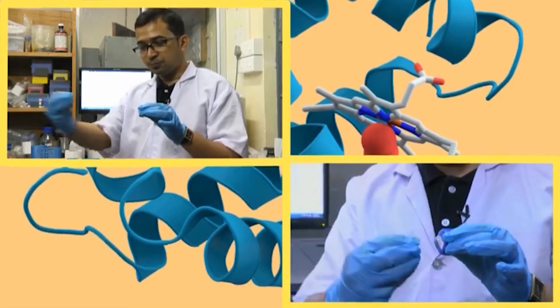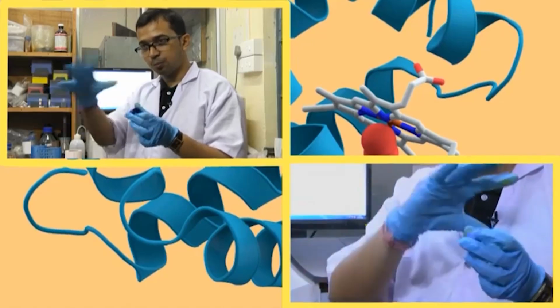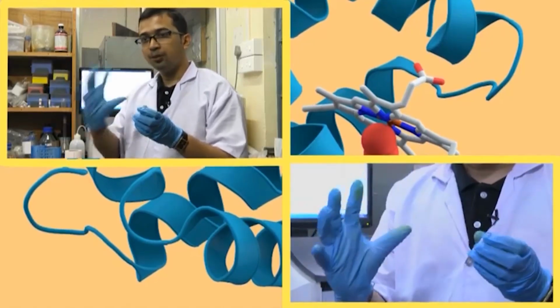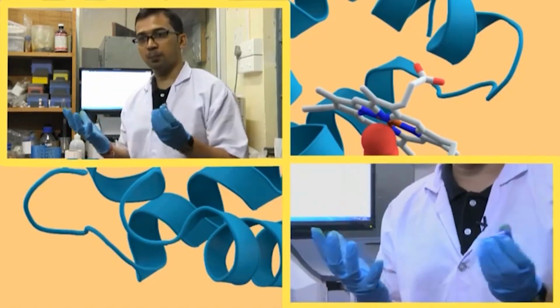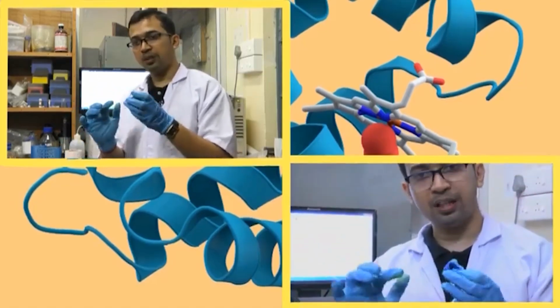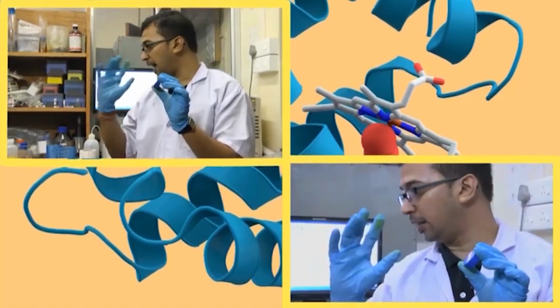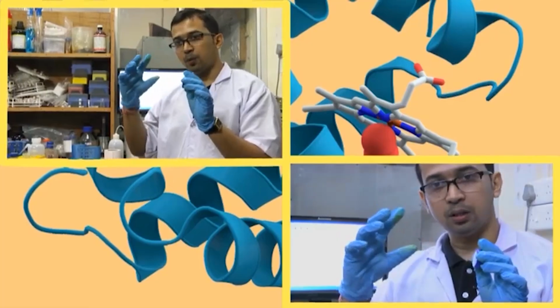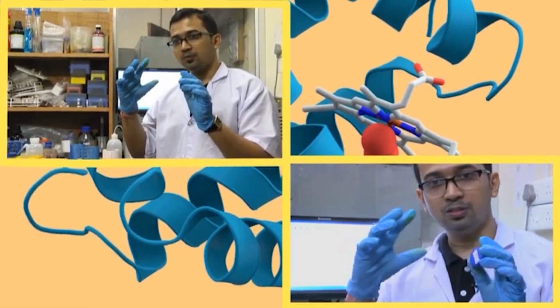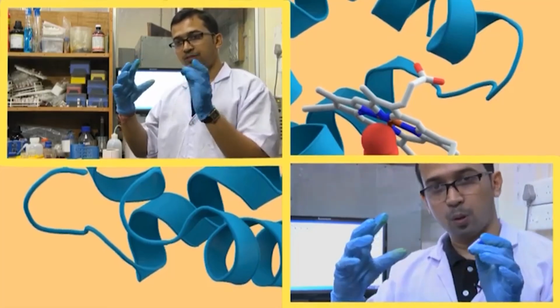Now, light is emitting, and the entire part of this gallic acid is exposed in this room, as we can see. Suppose this room is the UV chamber or the cuvette. Here is the gallic acid molecule, exposed to the light. Now, suppose my hand is the protein, this is the HSA protein, which is coming to the molecule.